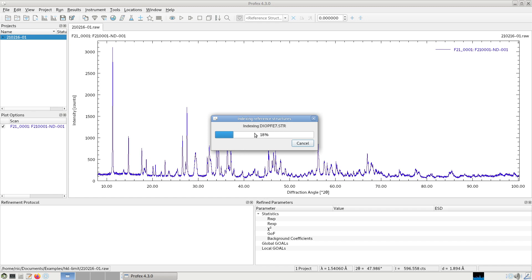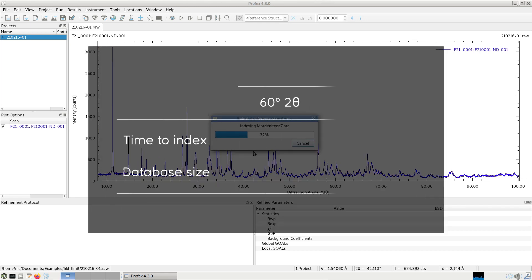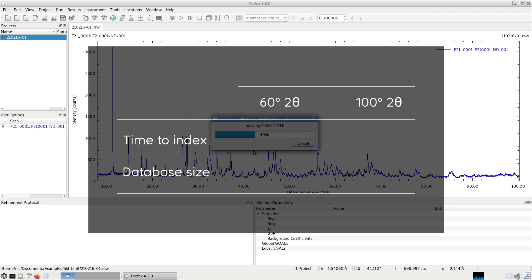On this modest computer running this virtual machine, when I set it up to 60 degrees, it took about 1 minute 50 seconds to index all the structures.